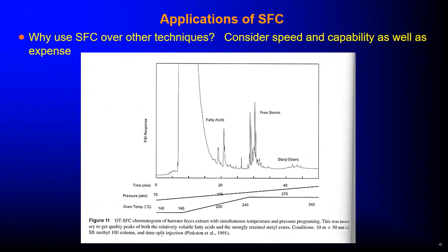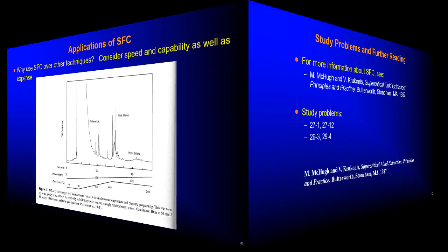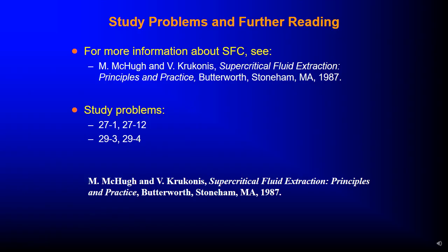Application of supercritical fluid chromatography. It considers speed and capability as well as expense. So with supercritical fluid you will get good speed at less expense. Then, we have just provided some reference materials that you can use for further studies.